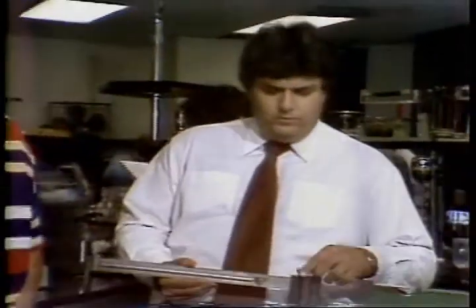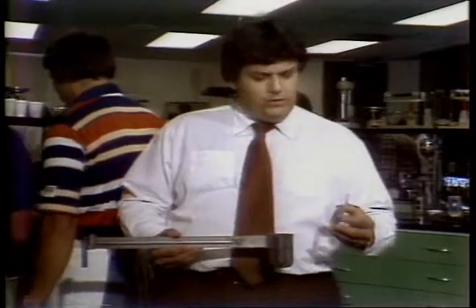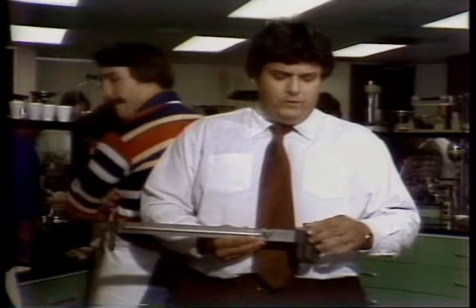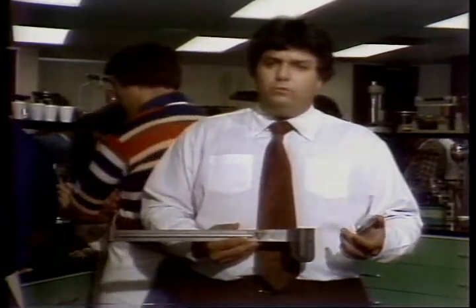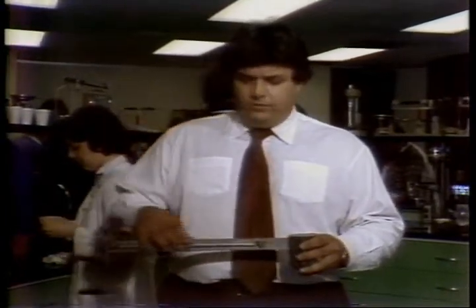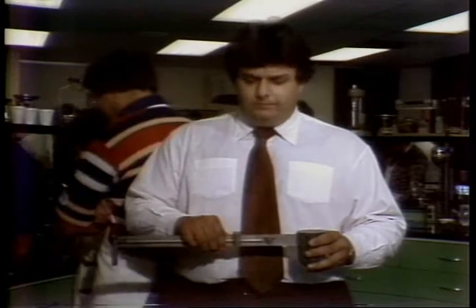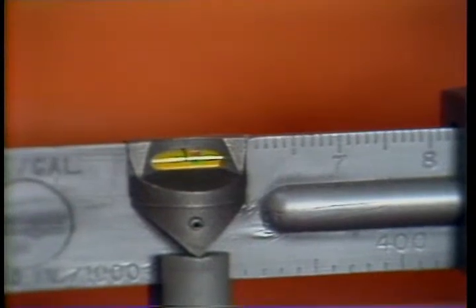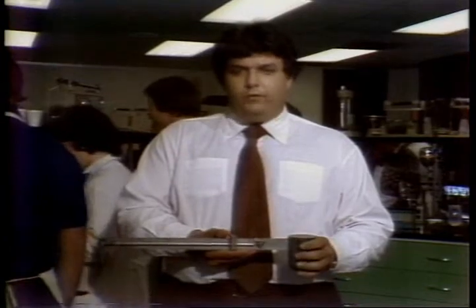In using the standard mud balance, 3 points should be made. First, the lid. The lid received with the mud balance should be one that's always used with the mud balance. It's a calibrated instrument, and the changing of this lid could alter the reading of the drilling mud. Secondly, the calibration. Water weighs 8.3 pounds per gallon. Calibrate the instrument by placing water into the bowl. Water, when balanced, should split the hair that is shown on the balance bubble.